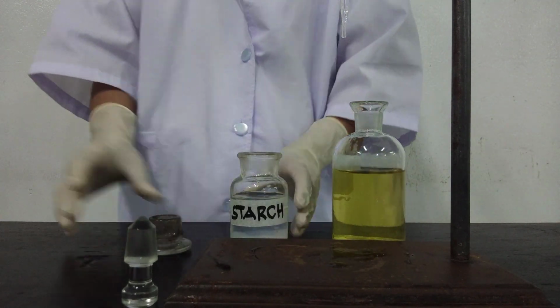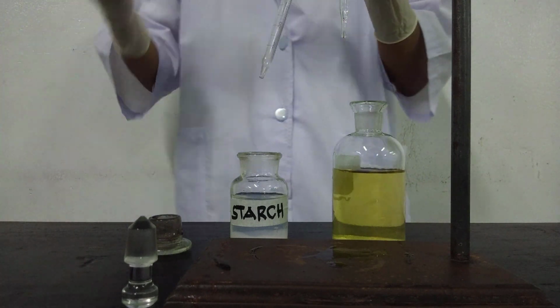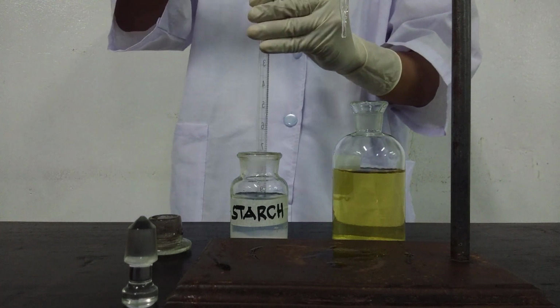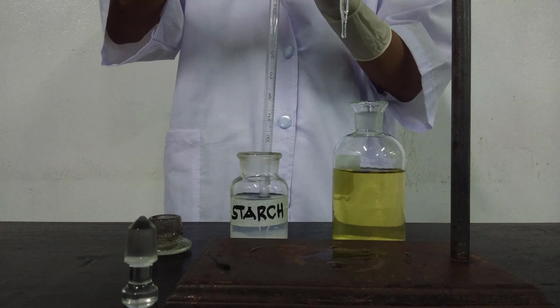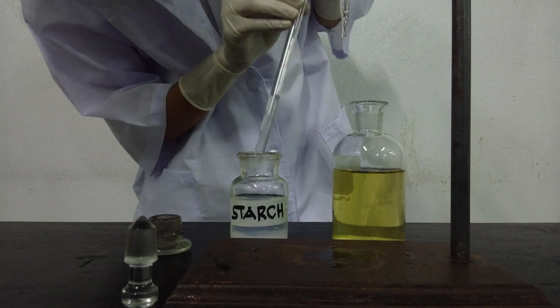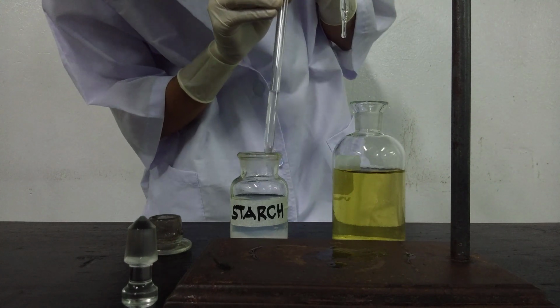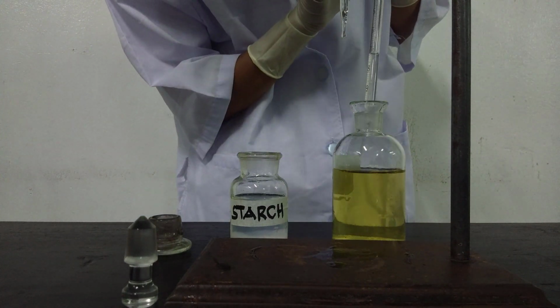Now we will need your starch solution for this next process. Using a different pipette, add 1 ml of starch solution and continue titration until the blue solution becomes colorless.